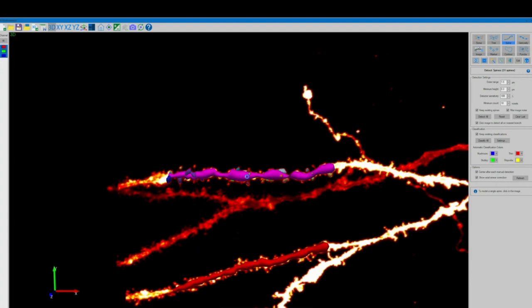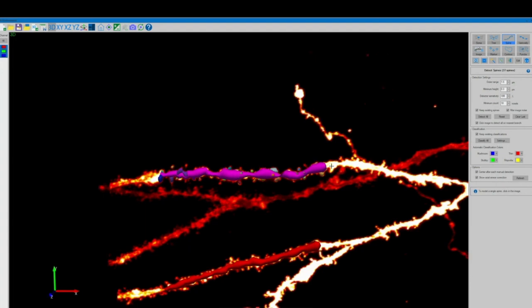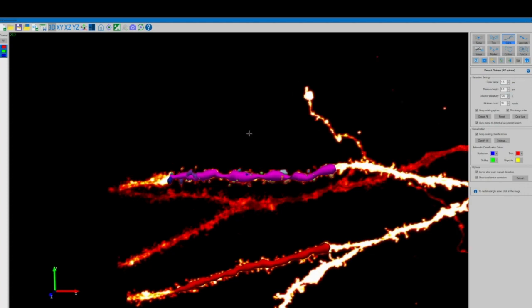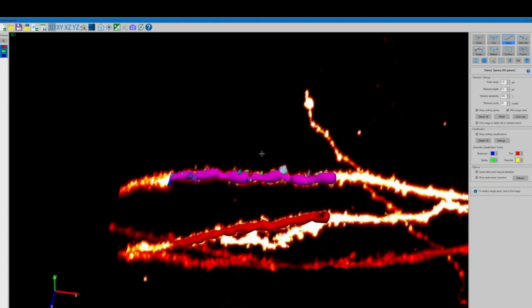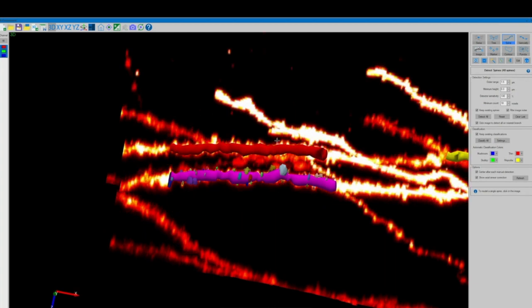We're going to go back and keep increasing that detector sensitivity until we notice with visual checks that there are not really any more spines to be detected on that segment.